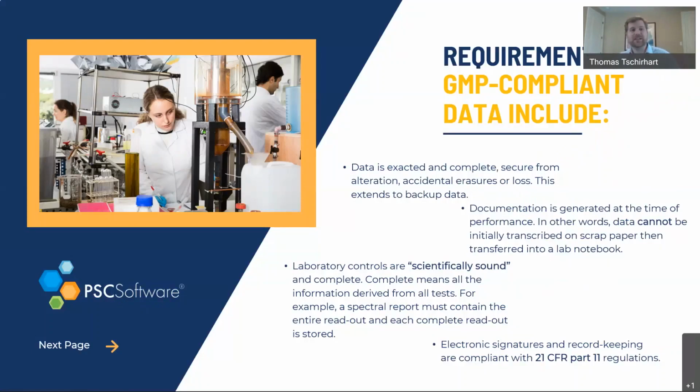Documentation is being generated at the time of performance, so basically we're not backdating our documentation. When it comes to laboratory data, our controls are sound and complete, and all the information from our test is captured. The full test result is captured for all of our tests. And when it comes to electronic signatures, everything is 21 CFR Part 11 compliant.